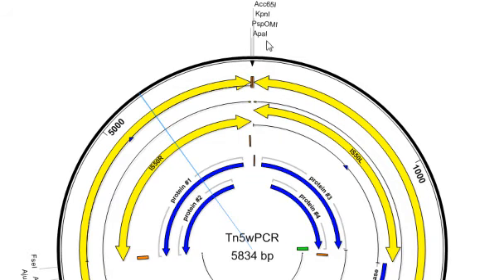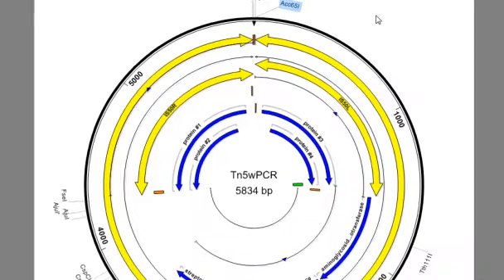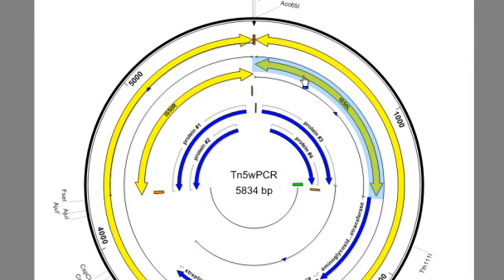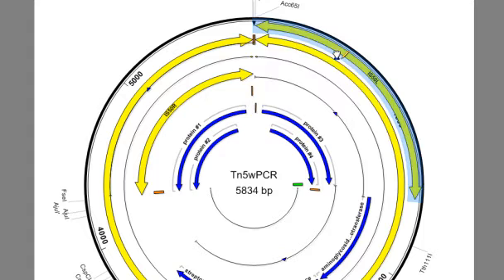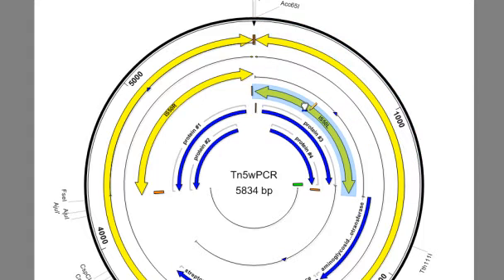To move an item, such as this enzyme label, just double-click to select it, and then you can click and drag it to wherever you want it to be. Features can be moved in the same way to fit your vision of how you want the map to look. So you just double-click a feature here to select it, and then you can click and drag it to where you want it to be displayed.